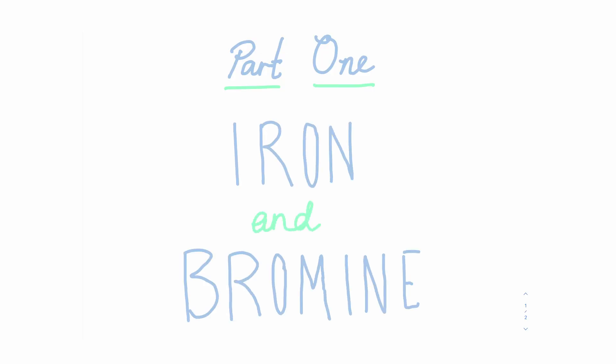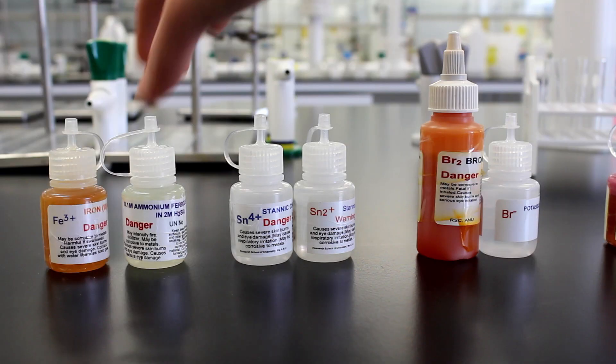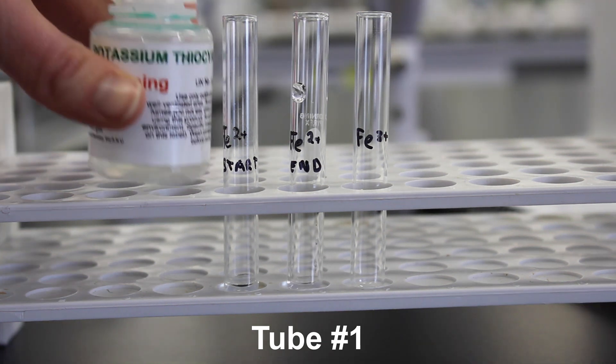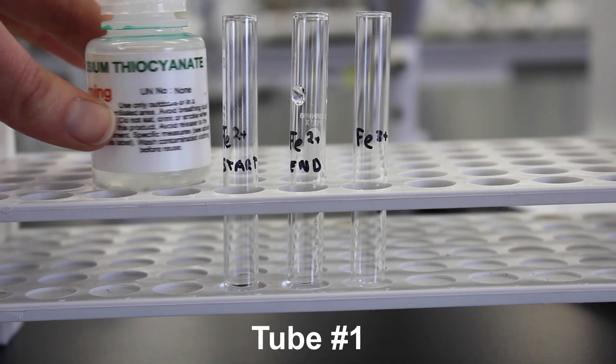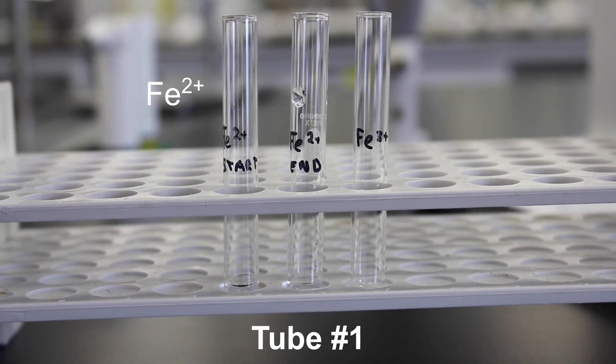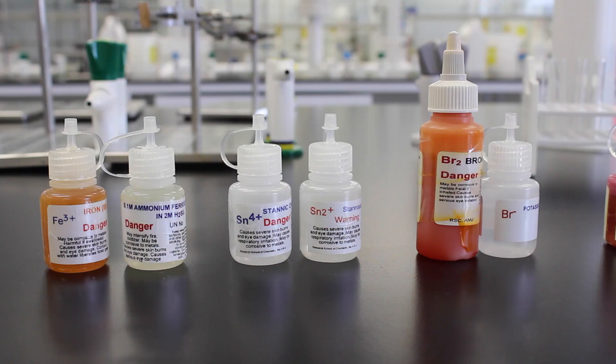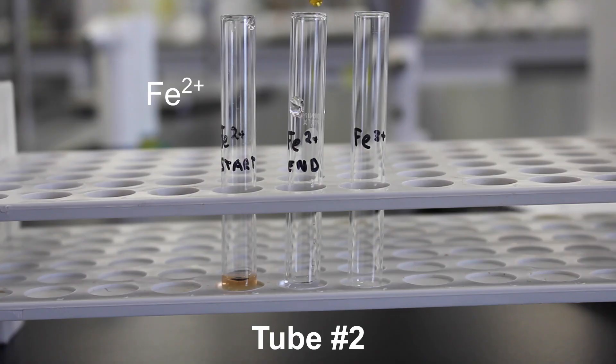Part 1: Comparison of Bromine and Iron Couples. Take your iron 2+ solution and add it into a test tube. Today we'll be comparing the solutions using the indicator potassium thiocyanate. Thiocyanate turns a dark bloody red in the presence of iron 3+ and you can see in the test tube on the left what it looks like when no iron 3+ is present.